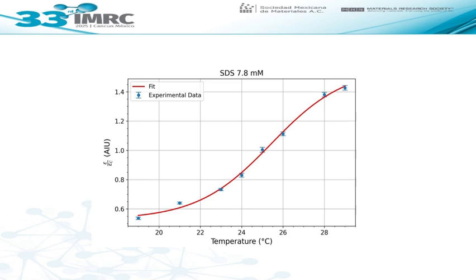This fit follows a sigmoidal behavior with an inflection point around 25.4 degrees Celsius that corresponds to the CMC reported in the literature.